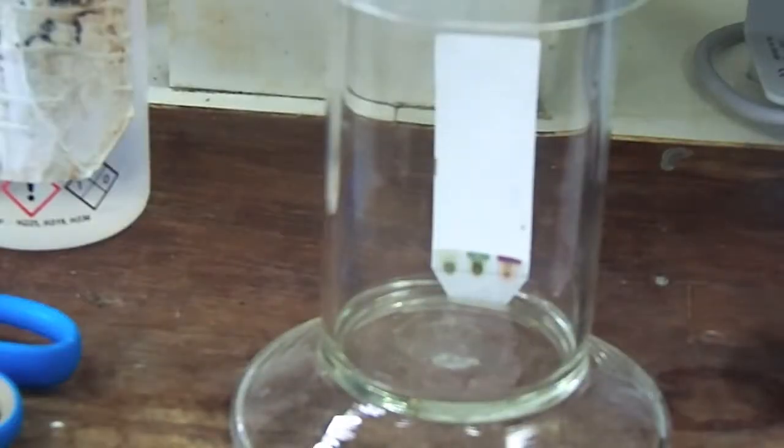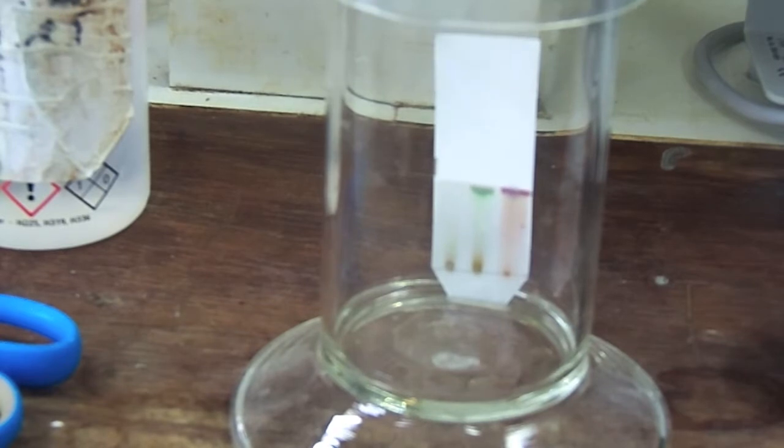TLC or thin layer chromatography is used to check which fractions your porphyrin is in. Use a suitable solvent, and a reference sample if you have one. As you can see here, fraction 1 has nothing in it, fraction 2 has an unwanted green by-product, and fraction 3 has the red porphyrin product we are looking for.